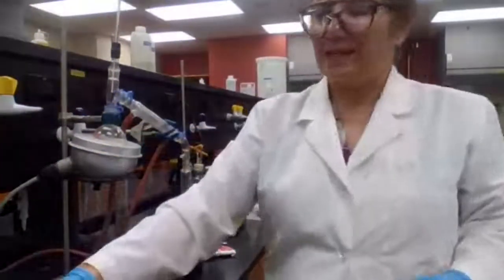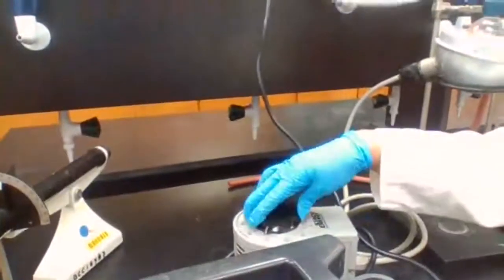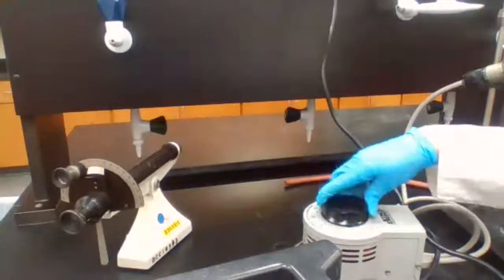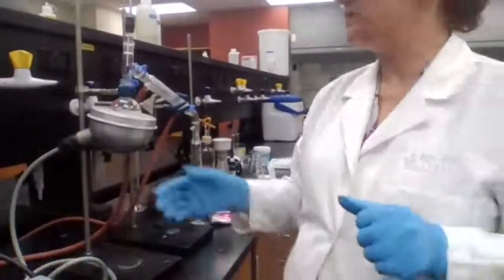What should be the setting on the power regulator? The power regulator adjusts the heating rate. Should I put it at slow or at a higher number? What does it determine? What should be the setting on the power regulator?